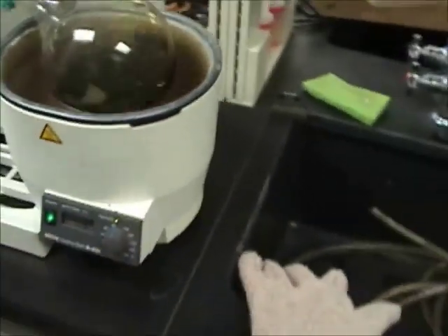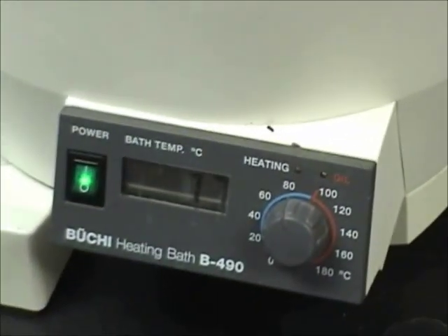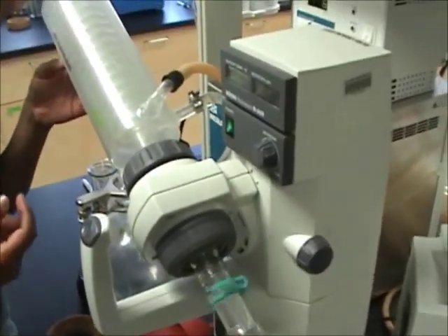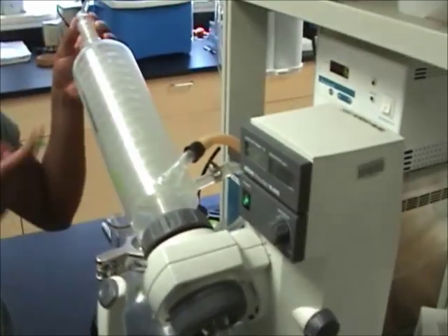The water temperature is kept at 77 degrees. At that temperature, because it's under low pressure, the ethanol in the water will boil — a normal boiling point would be like 100 degrees Celsius, but the vacuum makes it lower. It's just like going up in elevation.